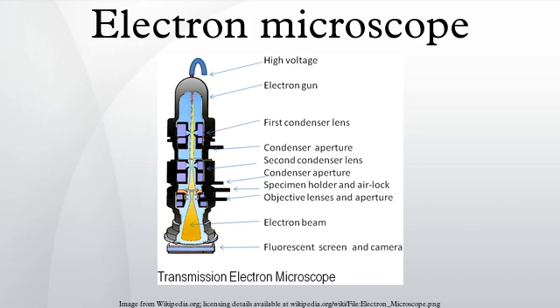The fresh tissue or cell suspension is frozen rapidly, then fractured by simply breaking or by using a microtome while maintained at liquid nitrogen temperature. The cold fractured surface is then shadowed with evaporated platinum or gold at an average angle of 45 degrees in a high vacuum evaporator. A second coat of carbon, evaporated perpendicular to the average surface plane, is often performed to improve stability of the replica coating.